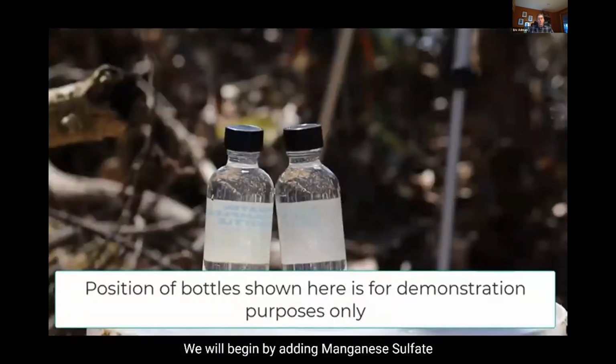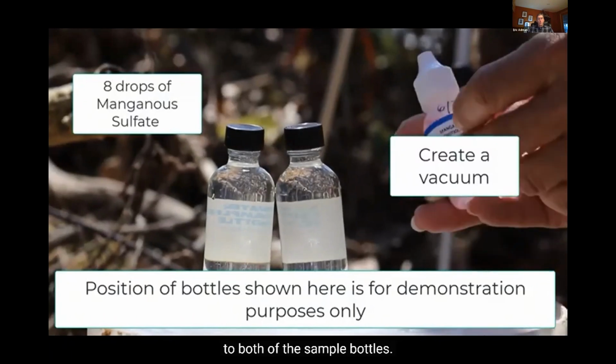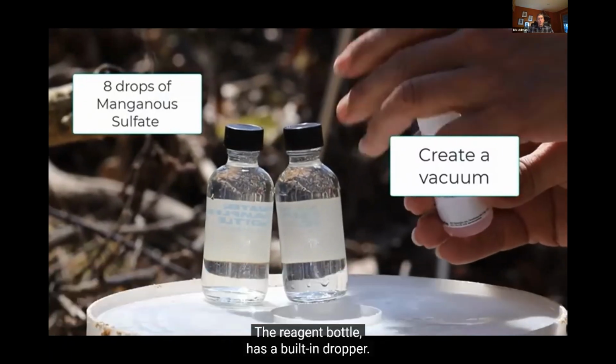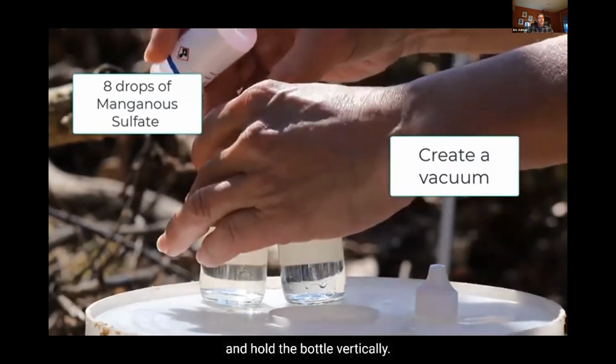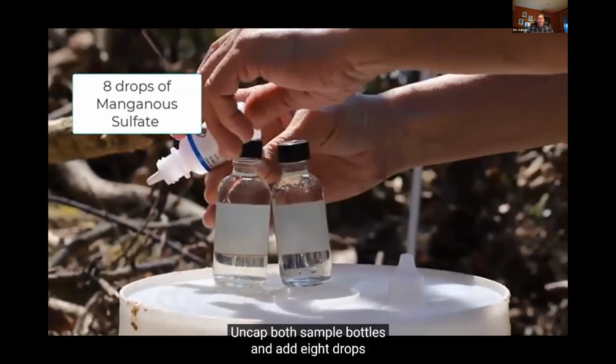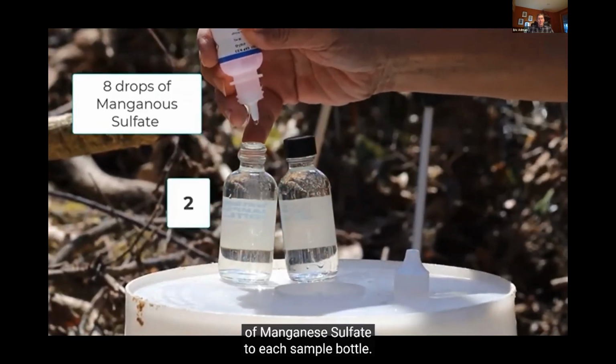We will begin by adding manganese sulfate to both of the sample bottles. The reagent bottle has a built-in dropper. So remember to create a vacuum and hold the bottle vertically. Uncap both sample bottles and add 8 drops of manganese sulfate to each sample bottle.